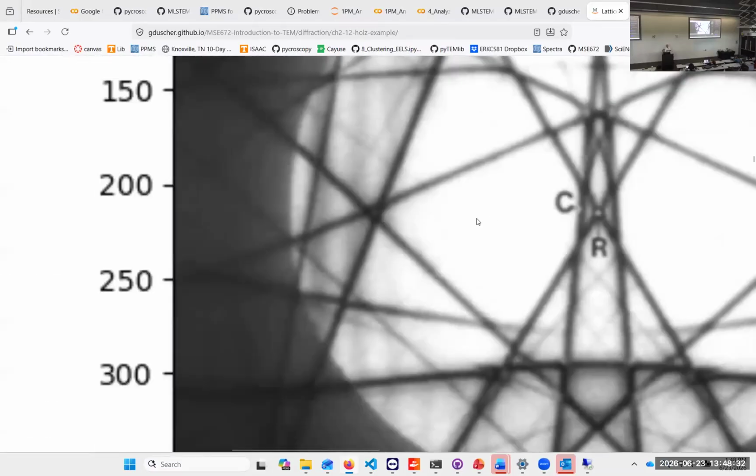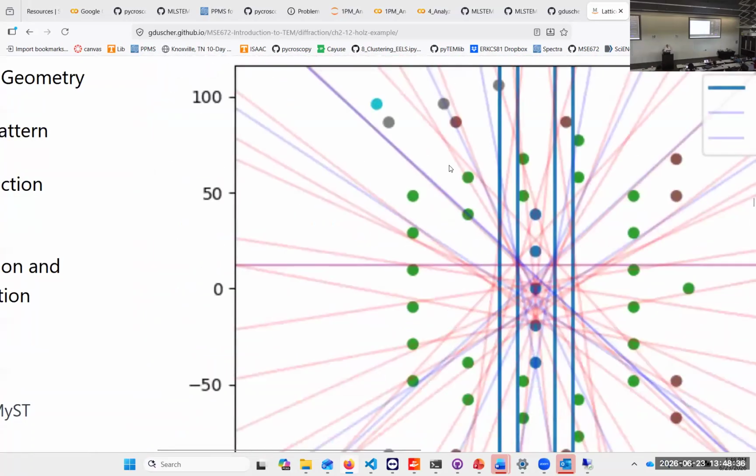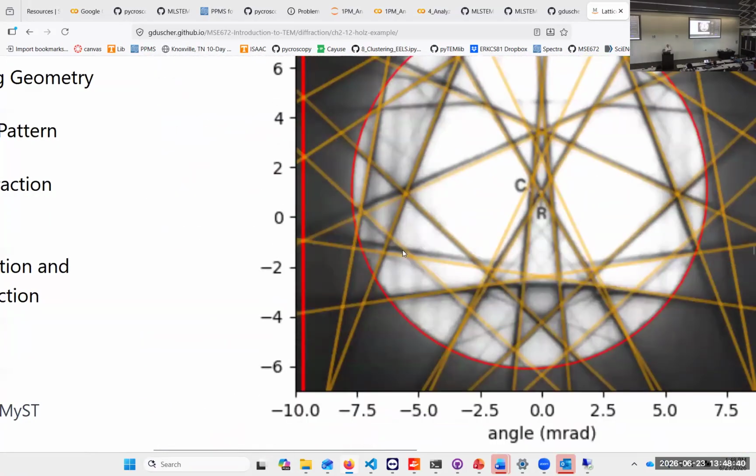So they don't meet exactly in one spot. And the question is, where does that come from? If you change that around and you change the lattice parameter by 1 picometer in one direction, the other, or in all three, it will move all of them.